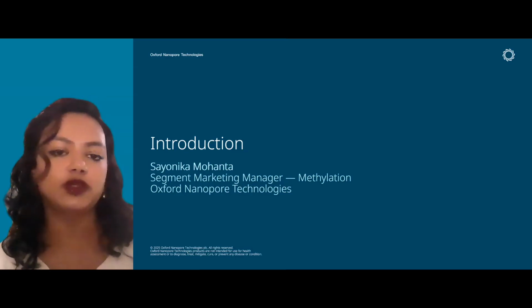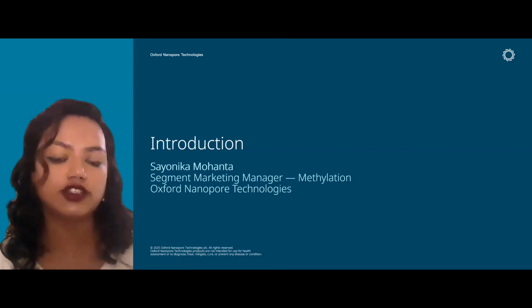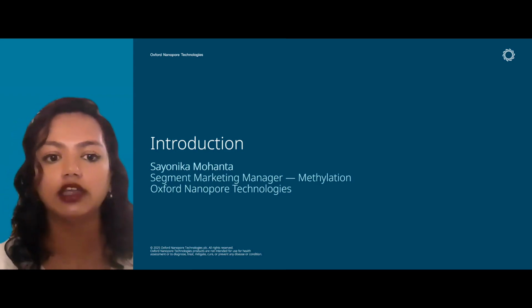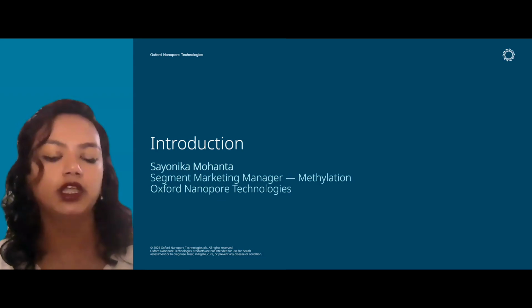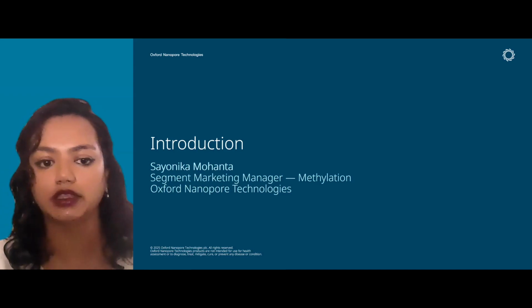Today, I'll kick off the session with a brief introduction on nanopore sequencing. I'll discuss the advantages of using nanopore for multiomic studies, including its ability to capture full-length DNA and RNA sequences, detecting base modifications directly, and delivering real-time data. These features allow researchers to uncover intricate disease mechanisms that might be missed with traditional methods.